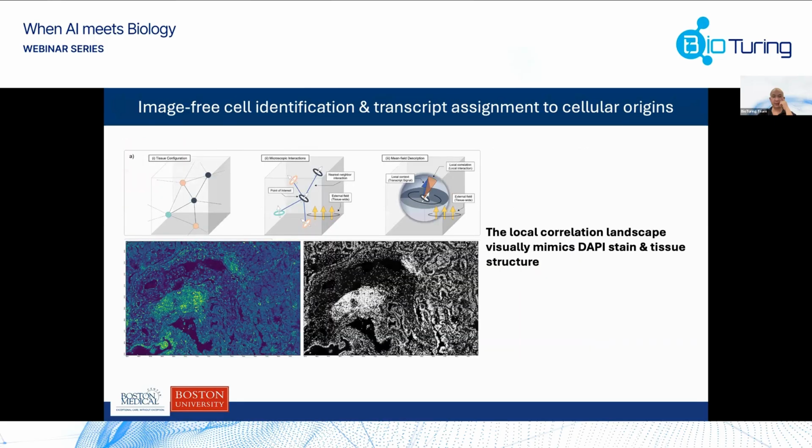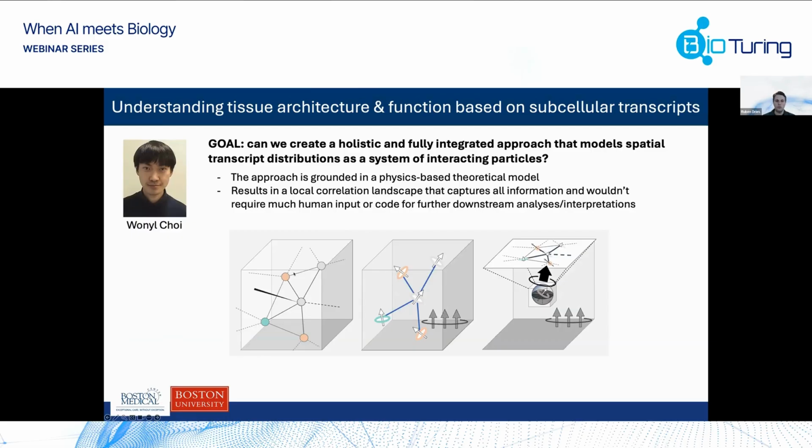Do you need 3D or just 2D? You can do 2D. It actually uses 3D. He calls transcripts with XYZ information already 3D. So even Xenium and MERFISH, their 2D output gives you, at a transcript level, 3D transcript coordinates. The Z-axis is relatively very thin, but it does provide that. You can do it in 2D, but you can scale it to any type of 2D or 3D data set.